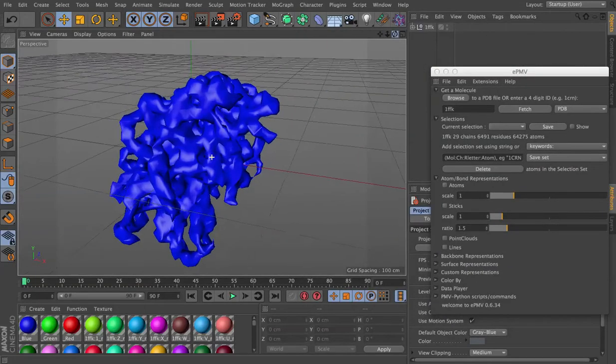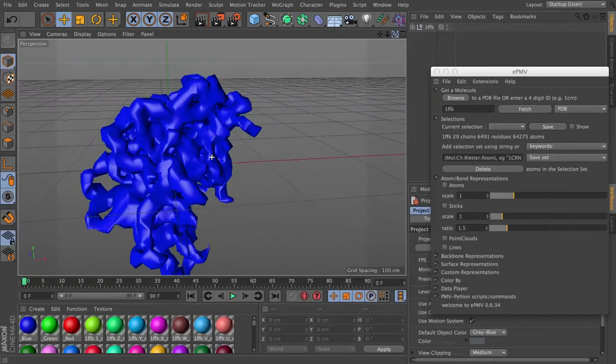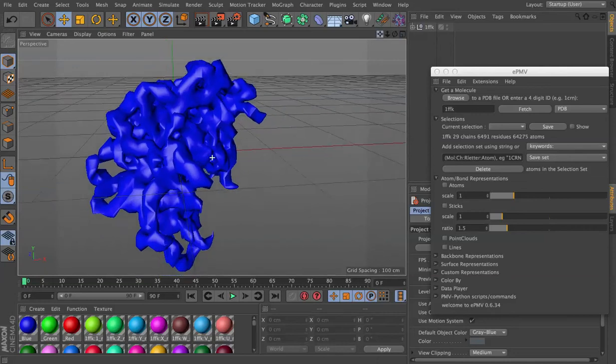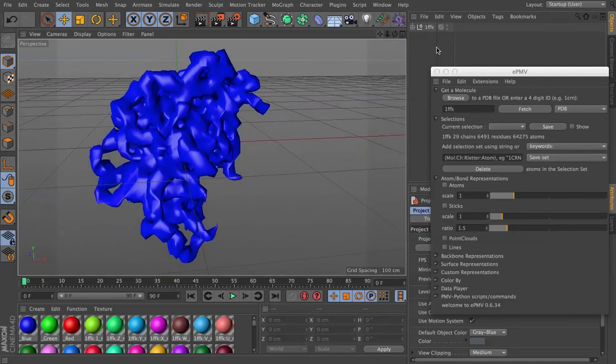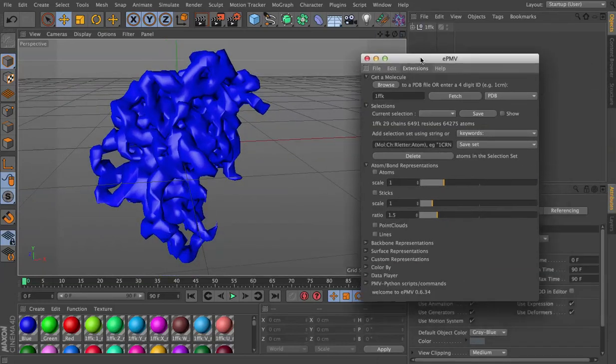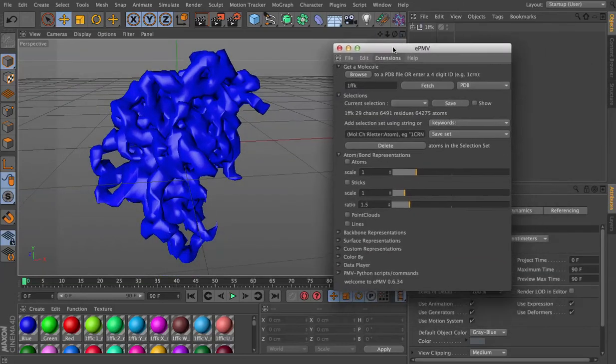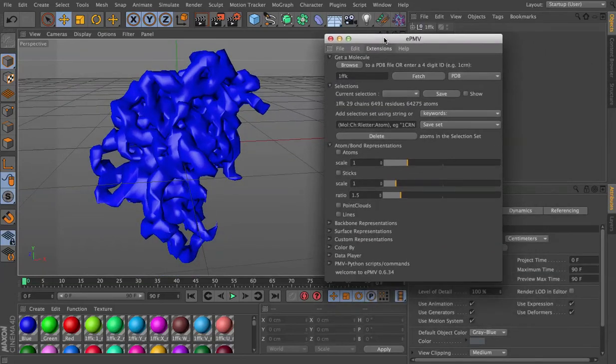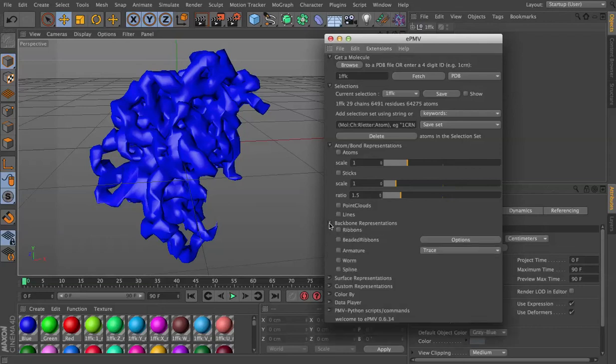Here is that structure by default, and first I want to just generate this backbone representation. We'll use the worm model, and this will take another few seconds, probably up to 30 seconds to generate.